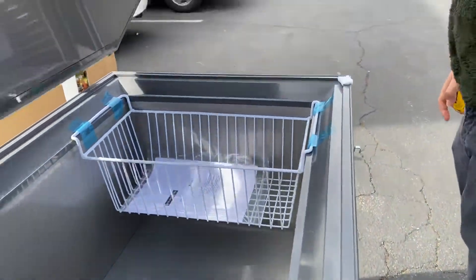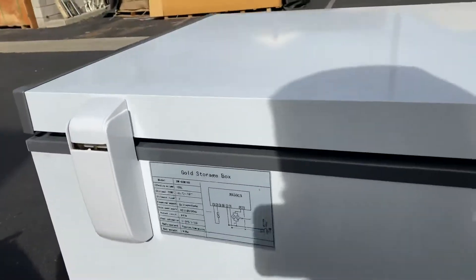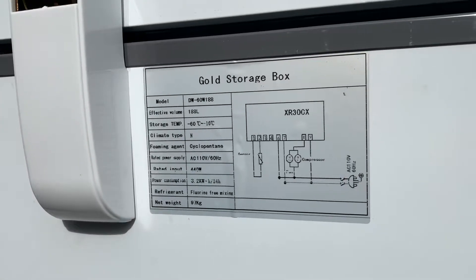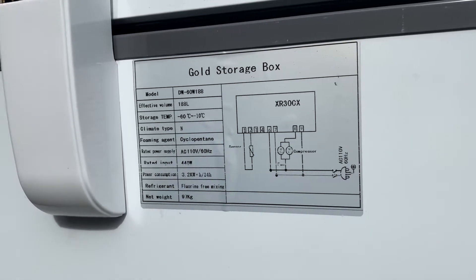As mentioned, the capacity is 188 liters — our smallest size. Over here in the back you can find a sticker with more information about this unit, including the model number, watts, voltage — which is 110 — hertz, and the temperature range.